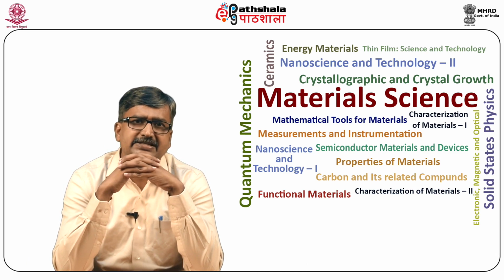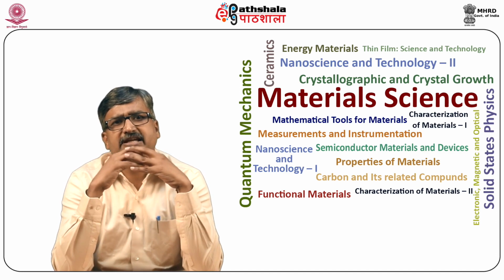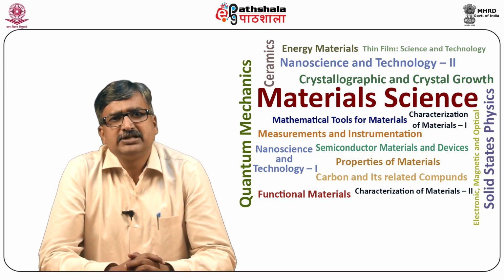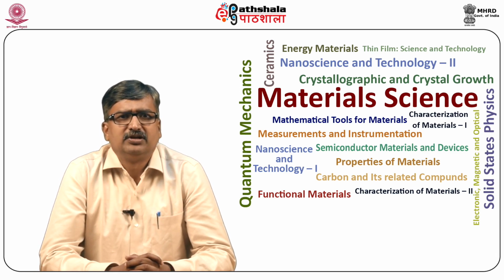In many applications, other techniques could be employed but do not rival UV visible spectroscopy for its simplicity, versatility, speed, accuracy, and cost effectiveness. UV visible spectroscopy is the measurement of the wavelength and intensity of absorption of near ultraviolet and visible light by a sample.